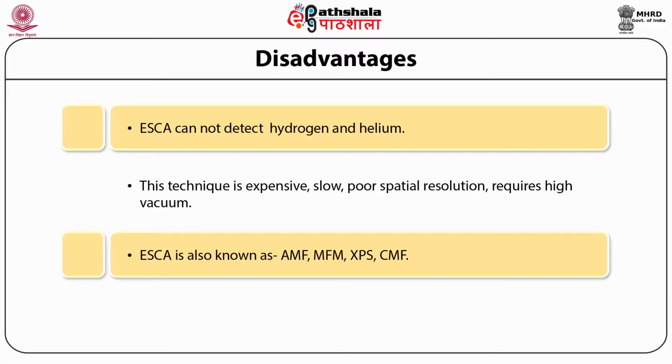In addition to this being very expensive, this being very slow, this being one which gives very poor spatial resolution and requires very high vacuum, it also cannot be repeated for ascertaining the experiment. You have to have this layer deposited afresh in order to carry out the analysis.